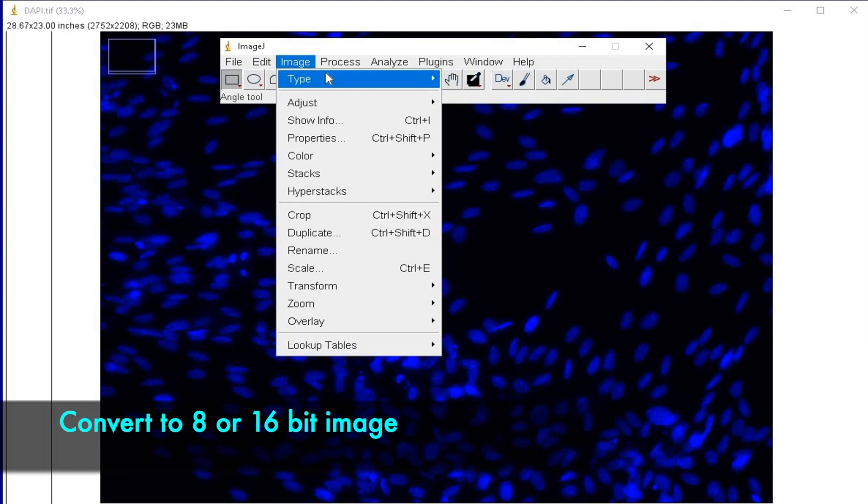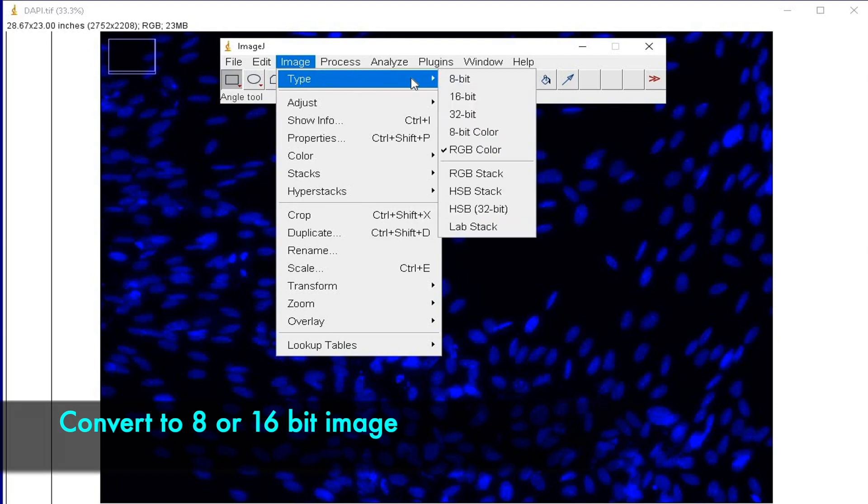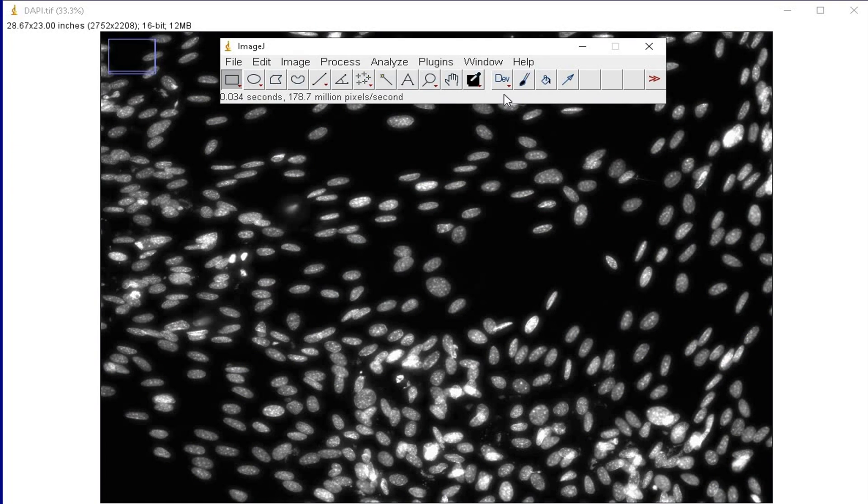First, the image has to be converted into an 8-bit or a 16-bit image.